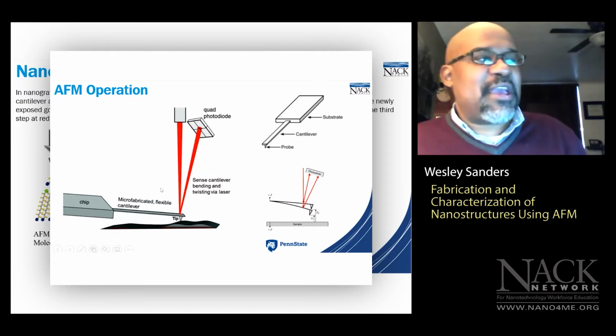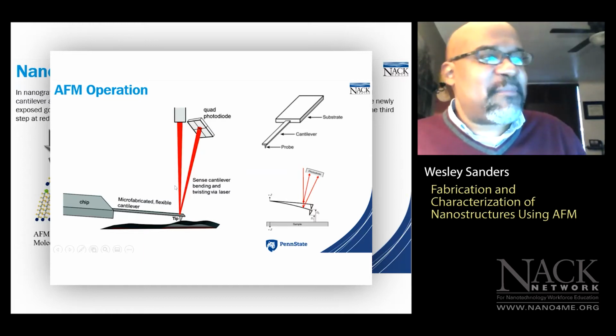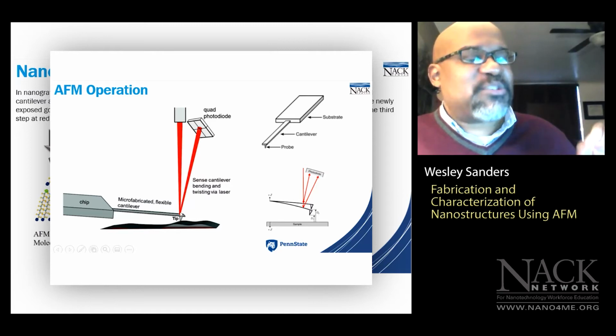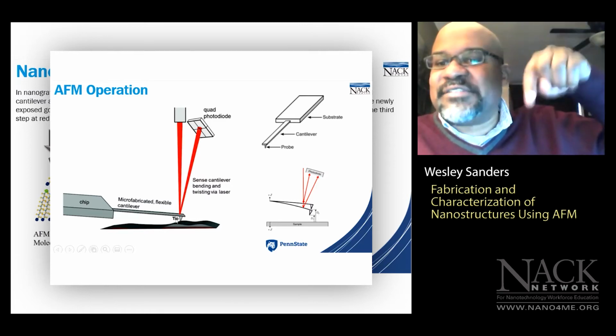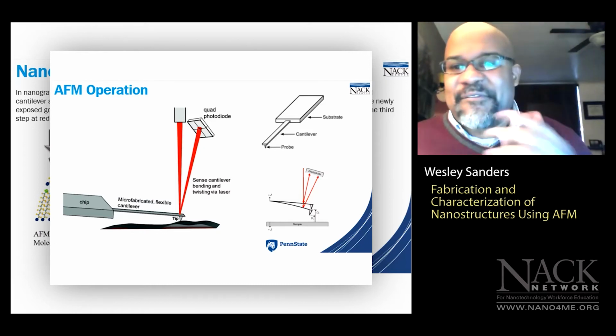So again, the laser doesn't impact the motion of the cantilever, doesn't influence the motion of the tip. The laser's job is simply to provide us a means by which we can track the motion of the tip as it traces the sample surface. Okay. So we're using an extremely low power laser, nothing really fancy or exotic. This is a very, very simple design.